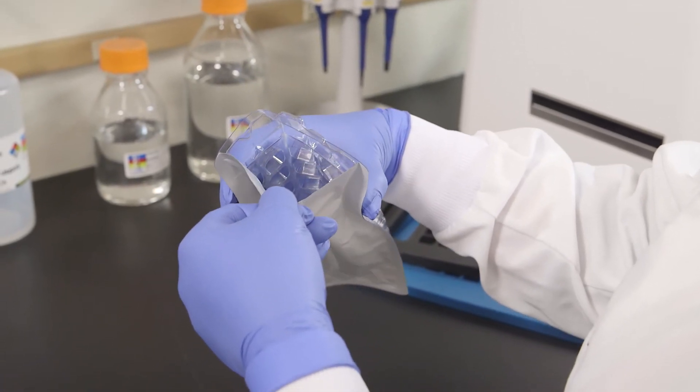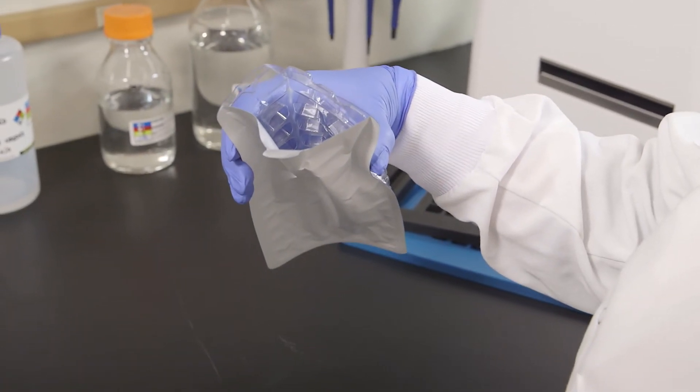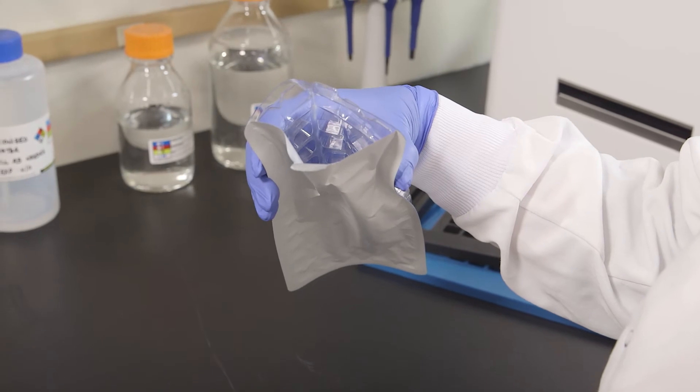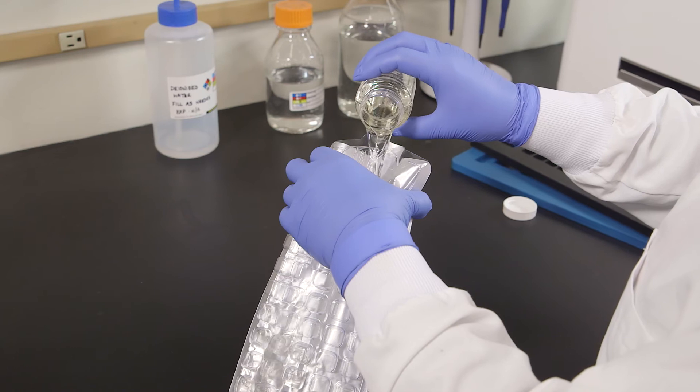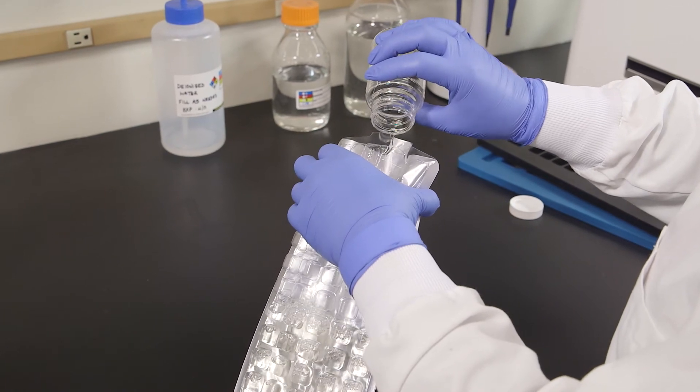Open the Quantitray by gently pulling the foil tab away from the plastic side. Be careful not to tear the tab. Do not touch the inside of the tray. Pour the sample mixture into the Quantitray avoiding contact with the foil tab.